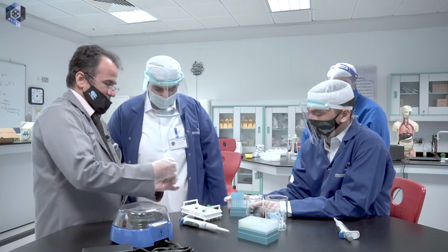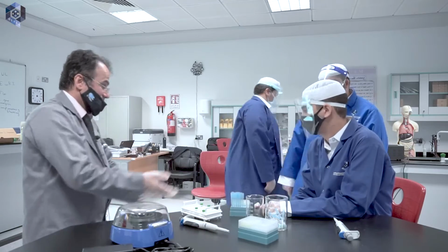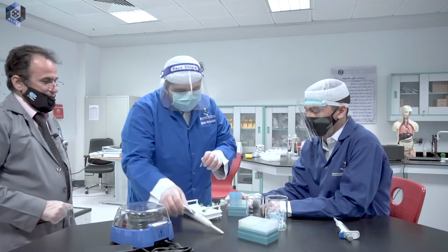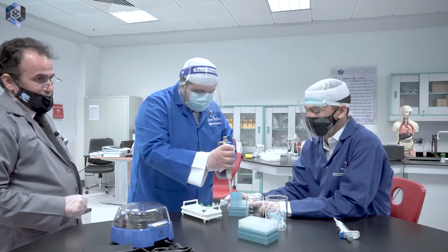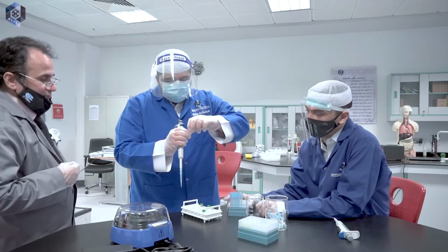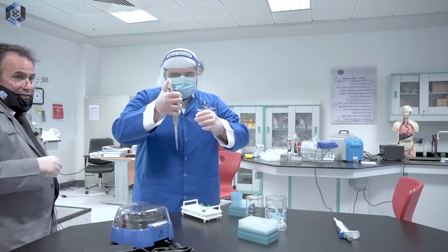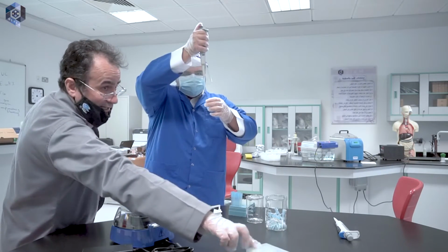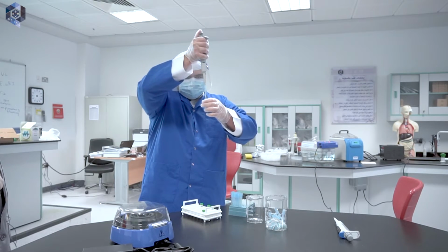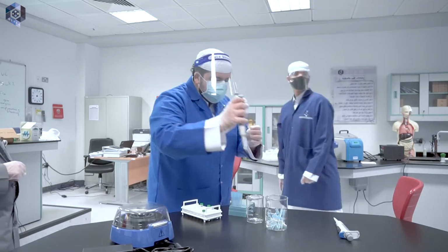Thank you. Take these sterile ones, don't let anyone open them. Don't open this because these are sterile pipettes. We will be using them now for culturing, for the last step.